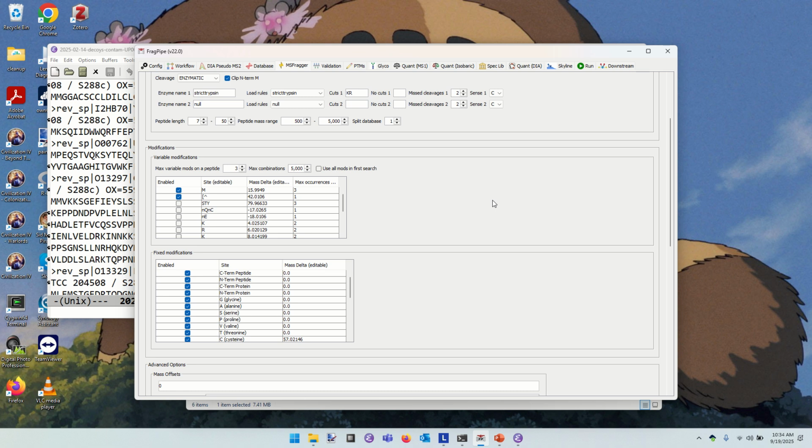We said that plus 16 was oxidation, right? So plus 42 on an N-terminus is what? Protein biochemistry question. You didn't realize that was coming. Okay. Yes, it's acetylation. Excellent. Nothing like looking up the answer in the back of the book. Yes, it's very commonly the case that the N-terminus of a protein carries a plus 42 mass shift. So we add that possibility here.